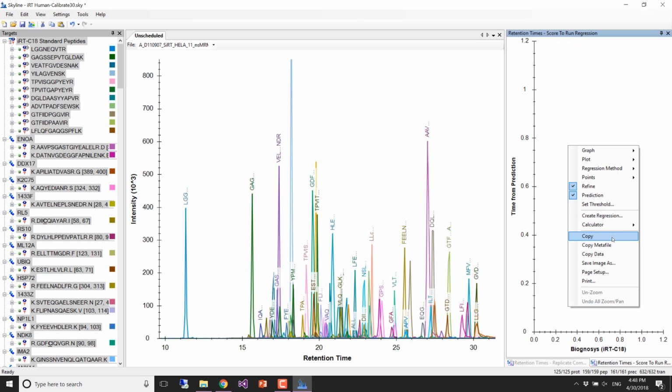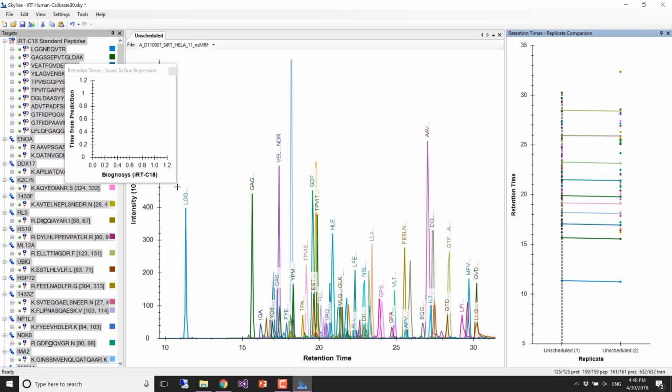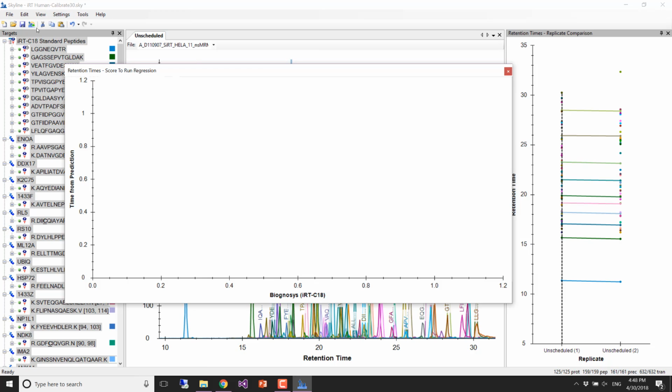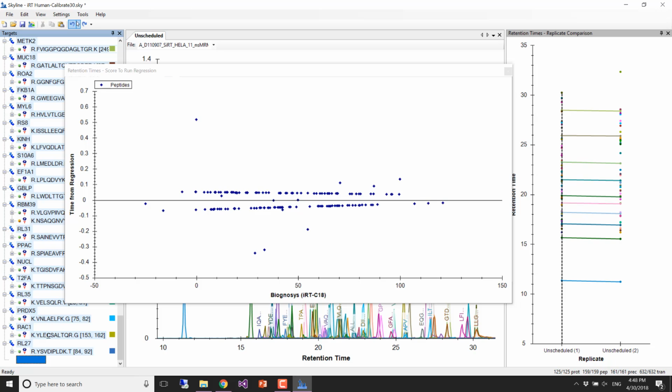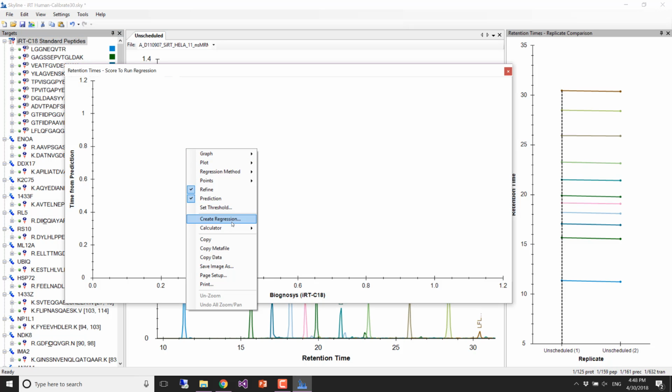Oh. What happened? Why are my residuals not coming in? Huh. Okay. What's it undoing? Change settings. Okay. Interesting. Whoa. But I don't really understand what it's undoing. Okay. Huh. I don't know what's up with that.